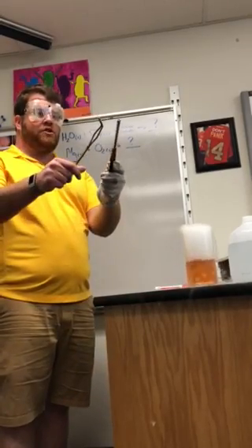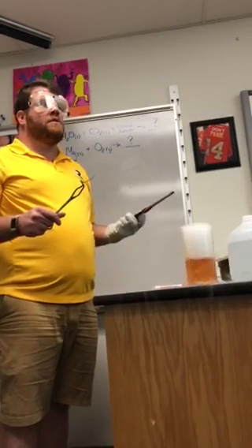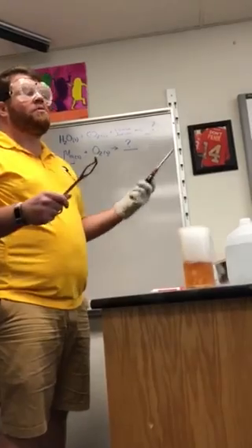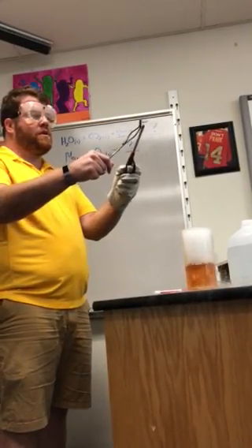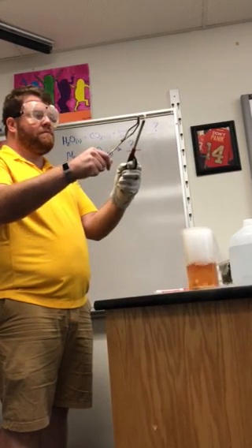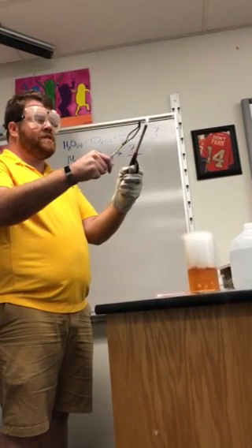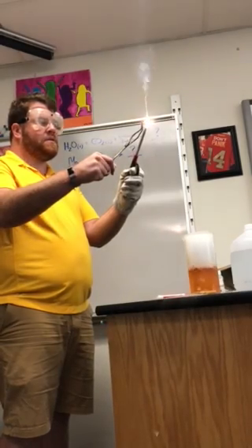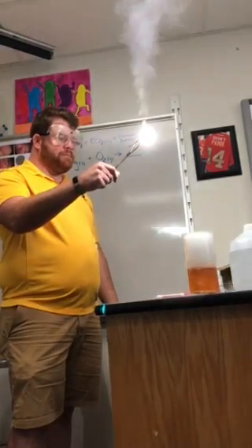So here we go. Do not look directly into the flame. When someone says that, what's your most likely action? To look into the flame. I'm telling you, please don't, okay? Oh, come on, you were working just last period. There we go. I'm gonna have to get another one of those. Looking at the flame. Yeah, but once this gets going, don't look at it. And here it goes. It's really bright. Super bright.